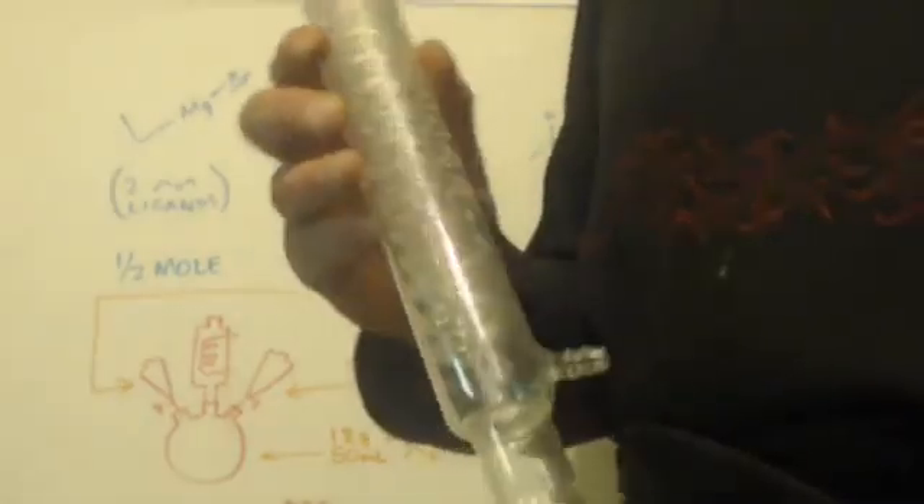Now this is called a Graham condenser. You can see it has a spiral. That spiral is where the product goes — into the spiral. The water goes around the jacket around the spiral.